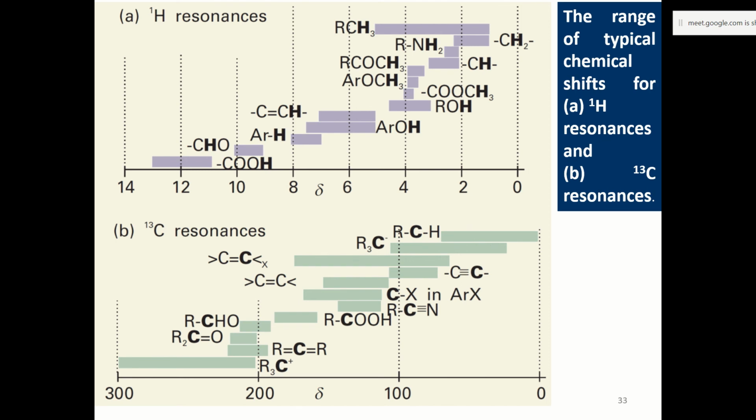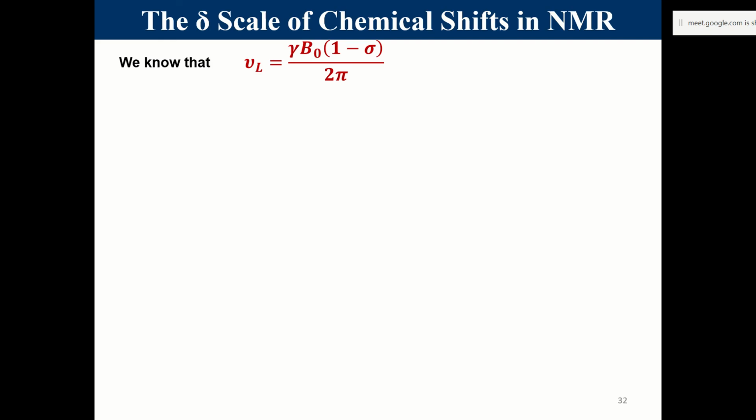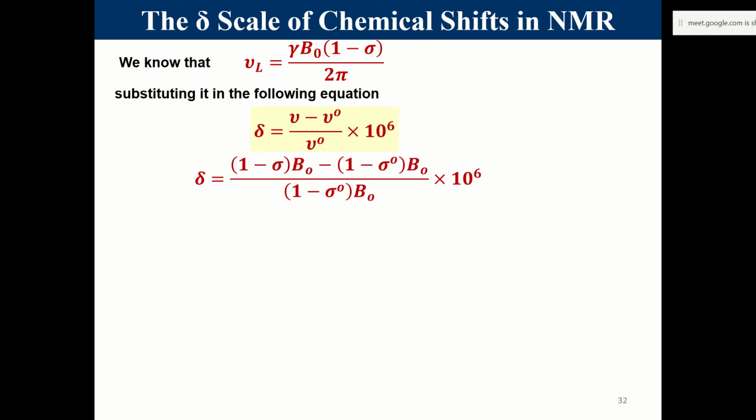The C triple bond CH has not been given there, appearing at some values somewhere. No, I have not shown it in my slide here. Okay, anyway.